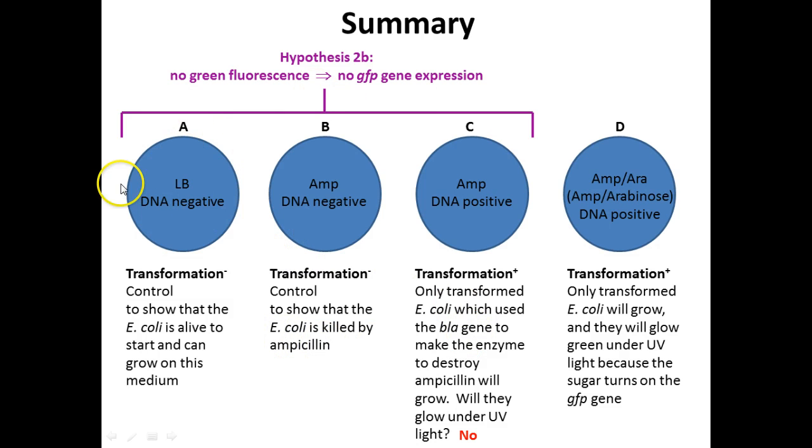Did you say ampicillin or arabinose? She said ampicillin. Oh, okay. Arabinose. It has to have the sugar. It's got to have the sugar, arabinose. It's bad that it's 2 A's.